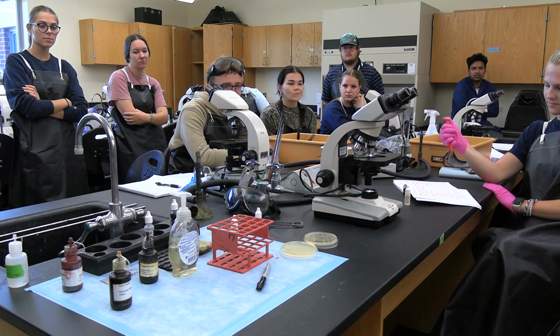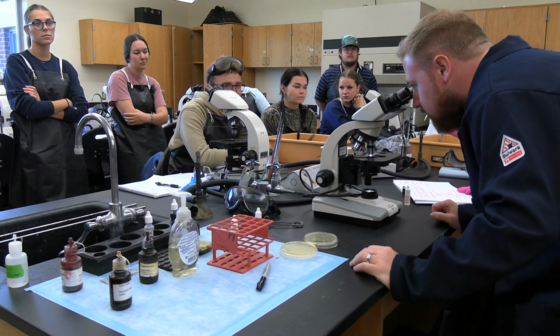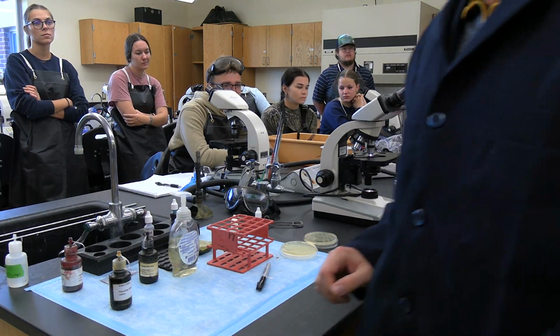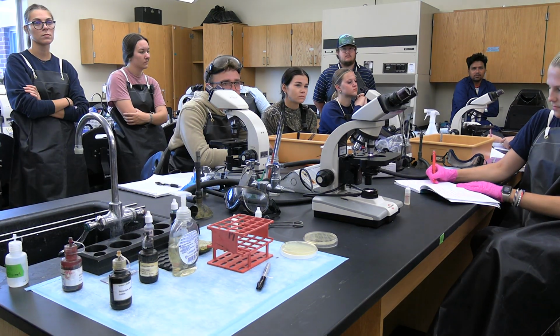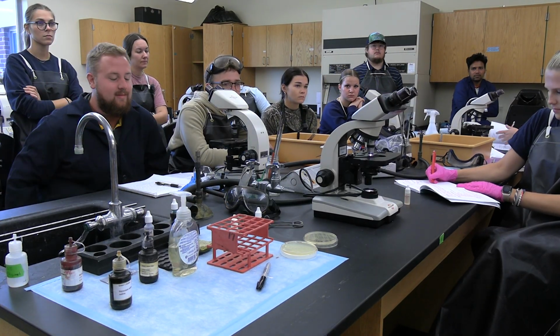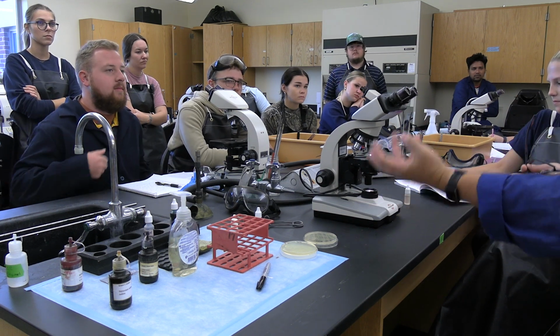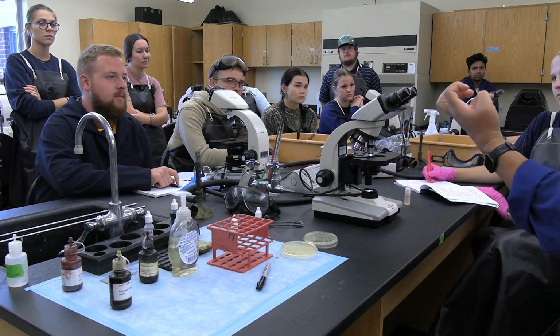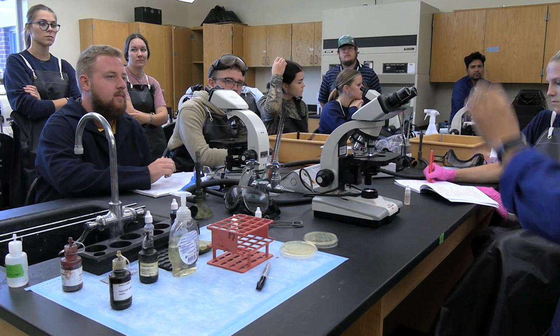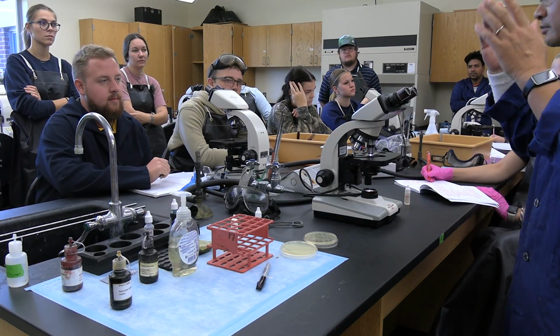So you're going to notice it. Some of the bacterial cultures in the plates, we didn't do a strict plating, so it's not a single colony. If you pick a cluster, sometimes you get a mixed culture. It's an example of cross-contamination. So you see it's pink, it's gram negative, but you also see something that is gram positive, which is mixed. And some are very short, some are long, some are huge, and you will notice that. Okay, so it's very interesting.